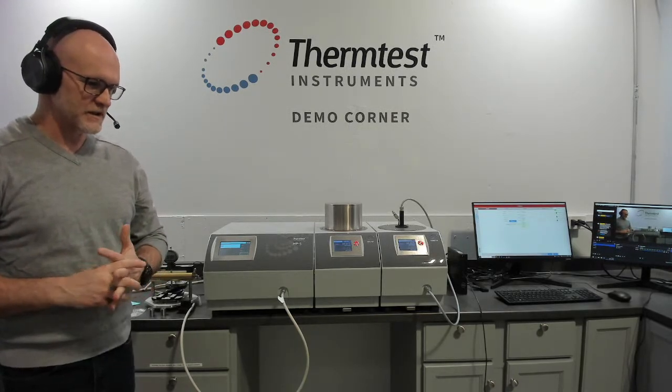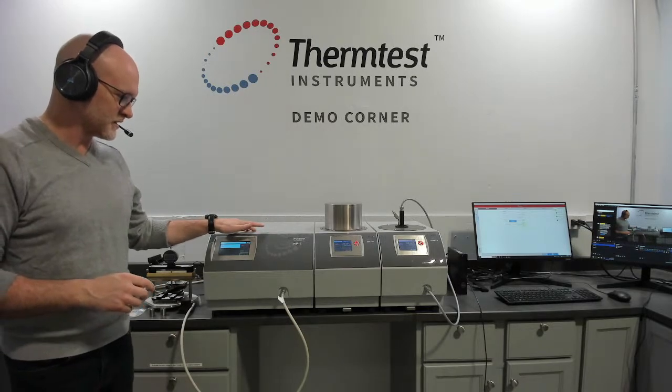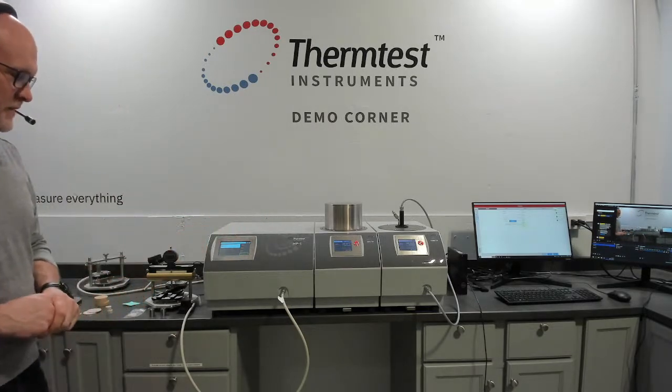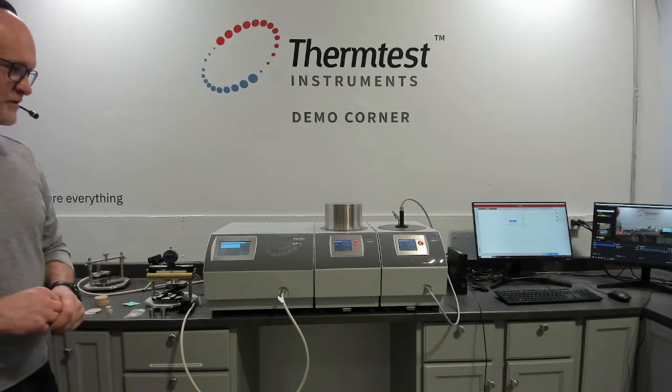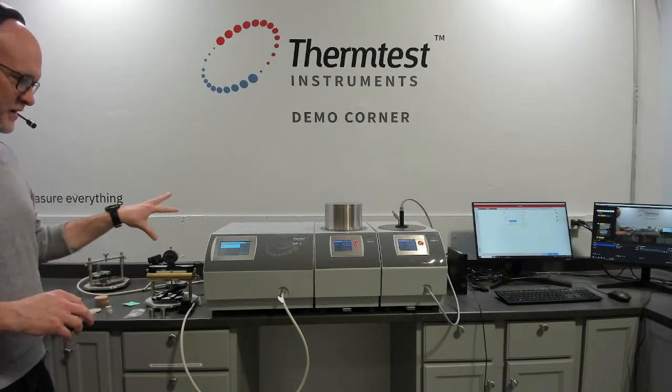Today we'll be demonstrating the MP-1 transient plane source method on the MP-1 for testing PEEK. There's a few different ways of measuring polymers depending on their dimensions. We'll talk a little bit about that.